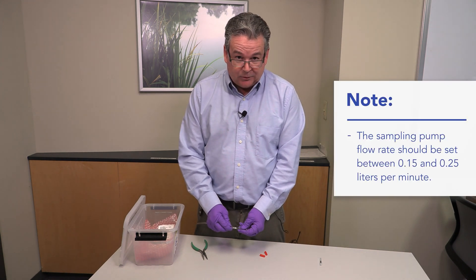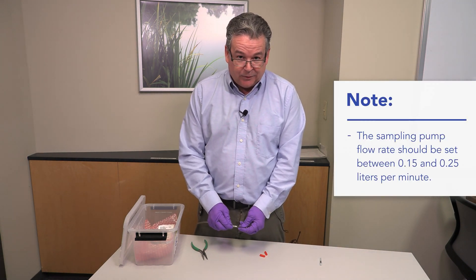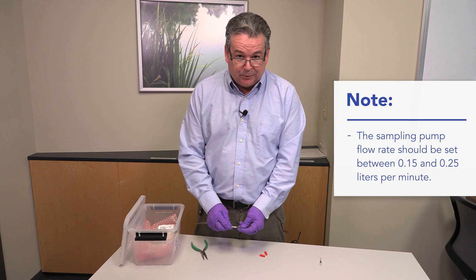Per the method, the sampling pump flow rate should be set to 0.15 to 0.25 liters per minute.